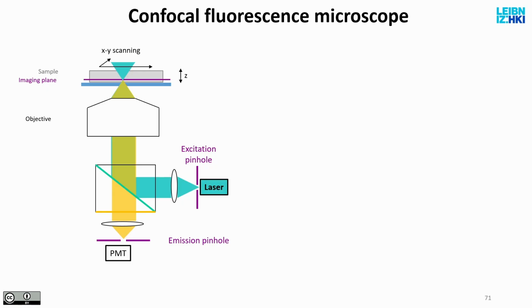You need an X scanner, which moves the light beam from left to right relatively quickly. The quicker the better, because the sooner you get through the sample. Then you need a second scanner, which moves this light beam 1 line lower and scans again, and scans again, and scans again. This is the Y scanner. This is much slower because it waits until the light beam goes from left to right. And finally, I have to have a focus motor that will move the focal plane across the sample programmably.